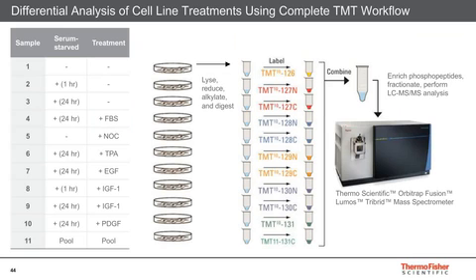One of the biggest benefits of measuring peptide concentration after digestion or after peptide cleanup is that you can normalize the amount of peptide loaded onto the analytical LCMS column. This results in higher run-to-run reproducibility and can lead to more peptide identifications if combined with optimized LCMS sample separation and instrument methods.